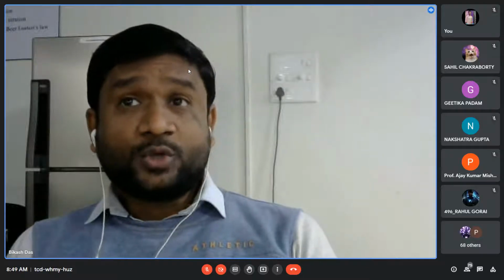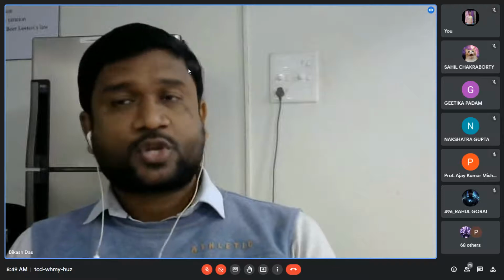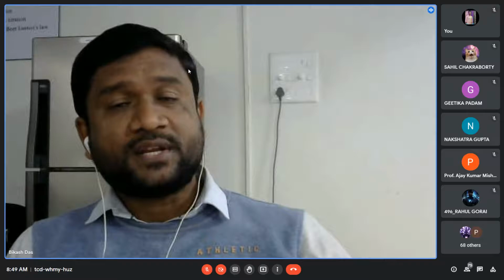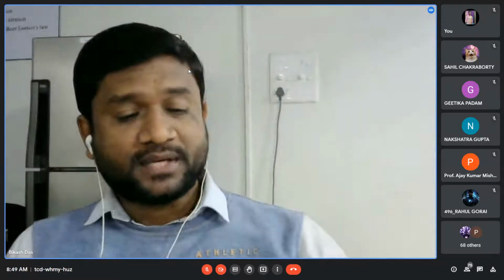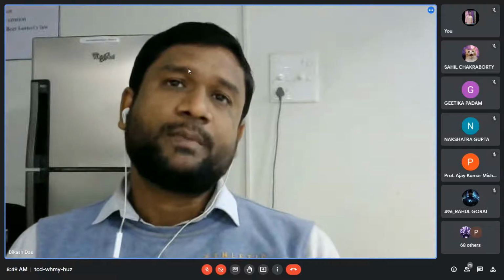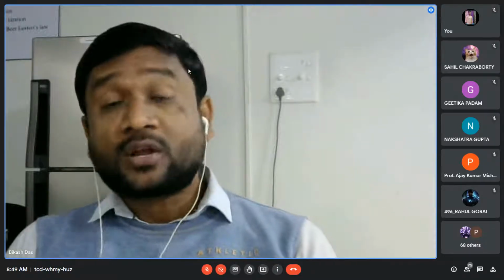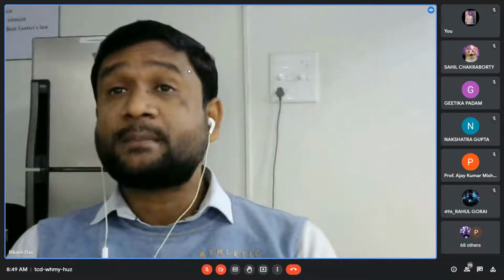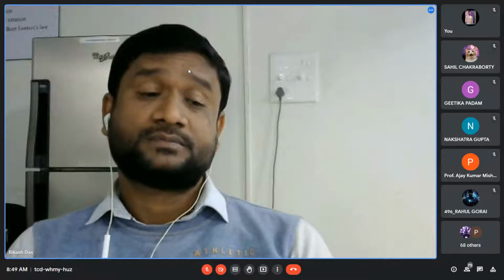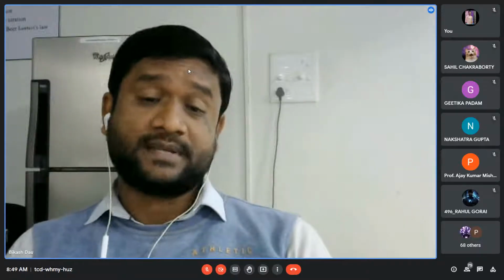So to know the neutralization point, you are going to measure the conductance. You have to measure the conductance by using one instrument, that is the conductometer. So whose conductance will you measure? Now you have to measure the conductance of HCl. The total conductance value depends on your H plus and Cl minus ions. So you have to measure the conductance of H plus and Cl minus ions.